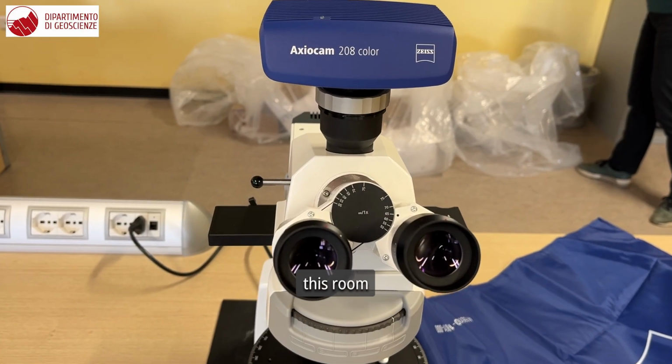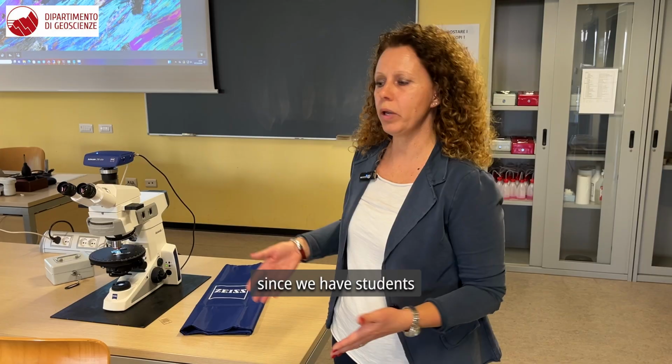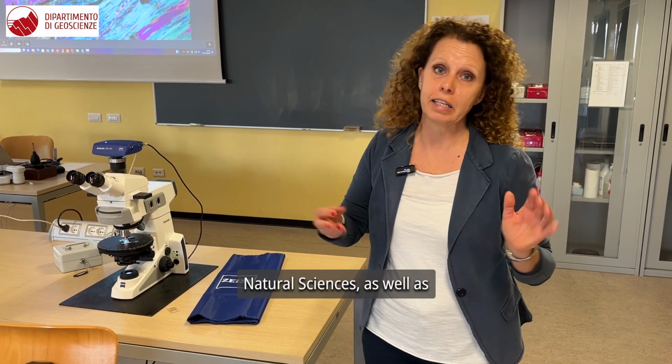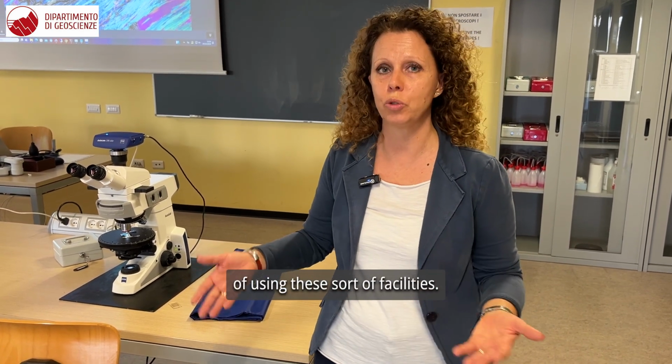We are pleased since this room will be used by students of different backgrounds, since we have students of the bachelor degree in Scienze Geologiche, Earth and Climate Dynamics, as well as Natural Sciences, as well as master students of Earth Dynamics and Applied Science to Cultural Heritage Materials and Sites, who take benefit of using these sorts of facilities.